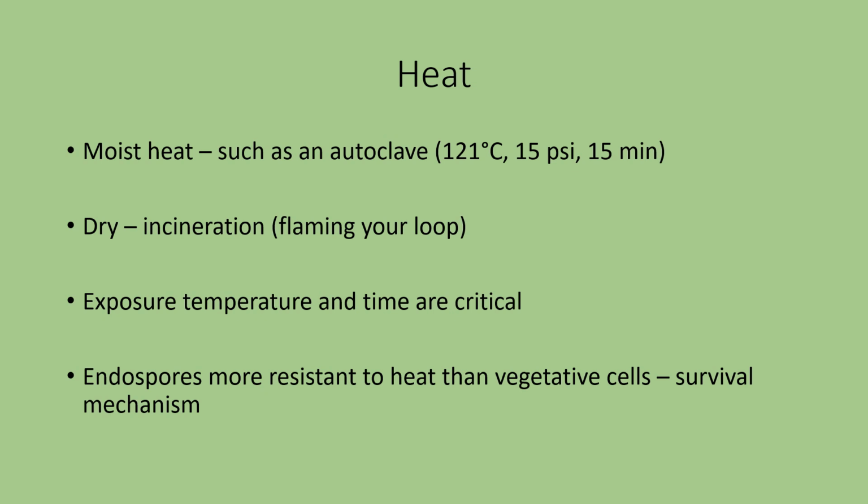The larger the amount of supplies, the longer you need to go. Also, something to consider is that the heat has to be able to penetrate through the sample. So let's say you have a flask with a liquid broth in it. If you have just a small flask, say with only 50 mils of broth in it, maybe 15-20 minutes at that elevated temperature and pressure will be fine.